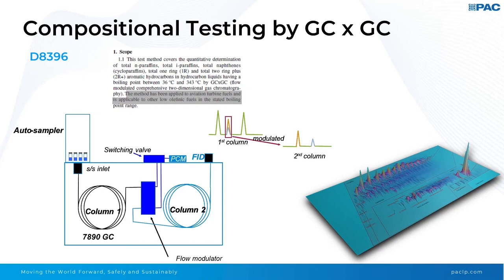So you can refer to these small peaks. What cannot be separated in the first column will be able to be separated in the second column with better separation and higher sensitivity. So if there are 2 co-eluting compounds in this single peak, these slices of co-eluting peak will be injected quickly into another column with different selectivity.